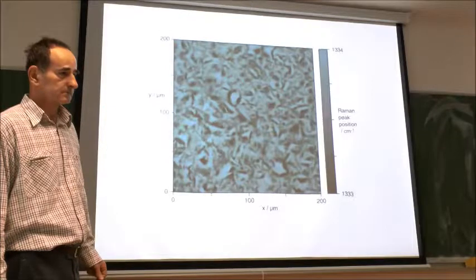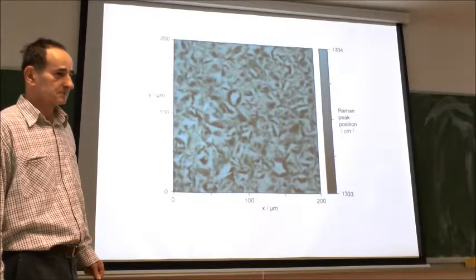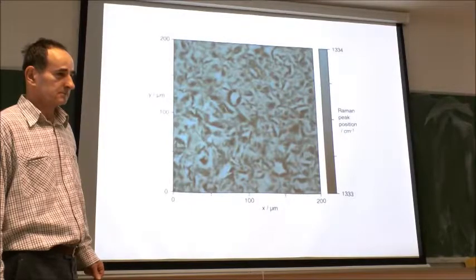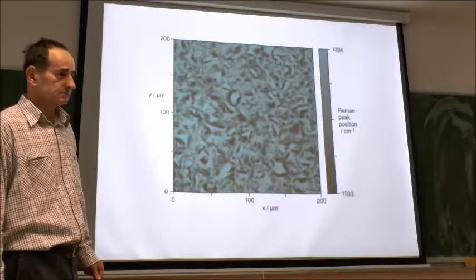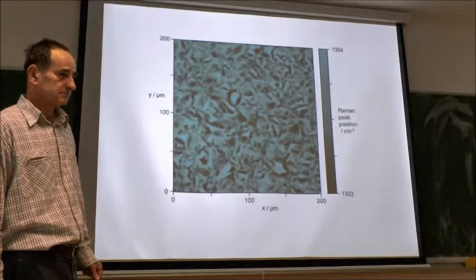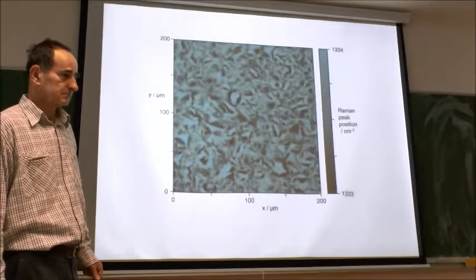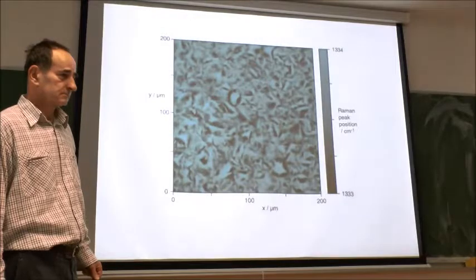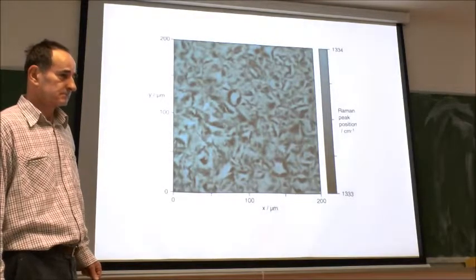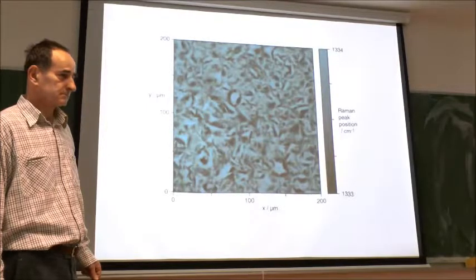A laser with, let's say, 500 nanometers has a better resolution than 700 nanometers, because that's physics. The second important part is the objective. We have objectives with high numerical aperture, so that means that they don't destroy the resolution. There are special objectives.